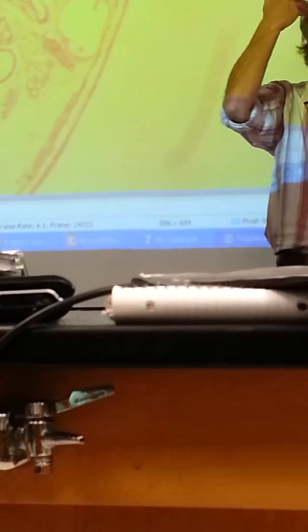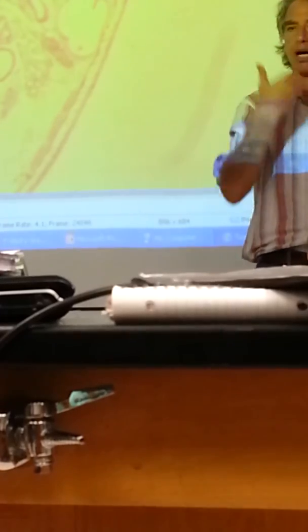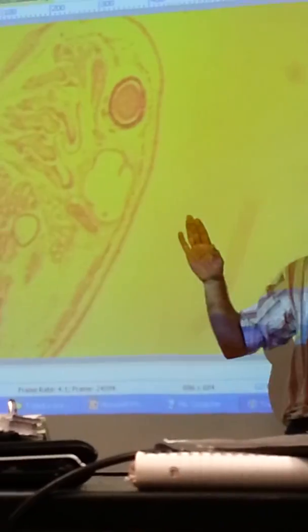Now we make this huge jump, and I've got other slides, but I just don't want to beat you up with slides. I probably already have. So what you want to do now is go to the 10 millimeter frog sagittal section. And what that means is you're going to be looking at a little froggy, and what they've tried to do is they've taken one tadpole and they've gone chop, chop, chop, chop, chop. And then they've laid all those little sections down on there.